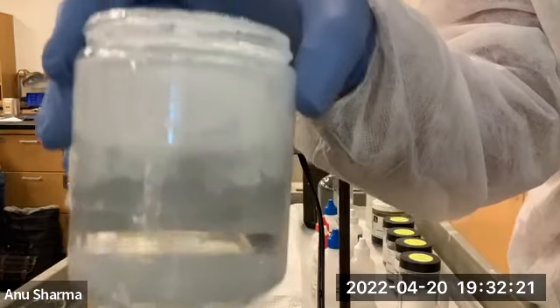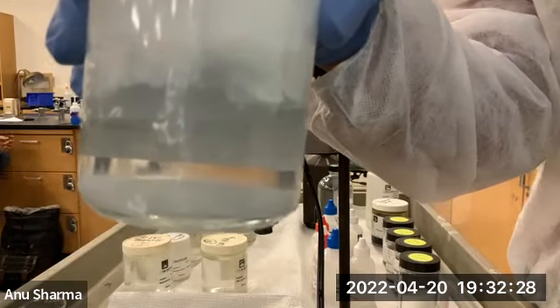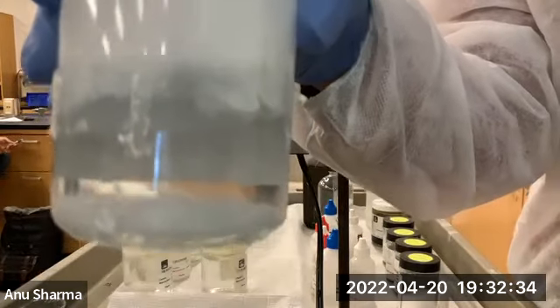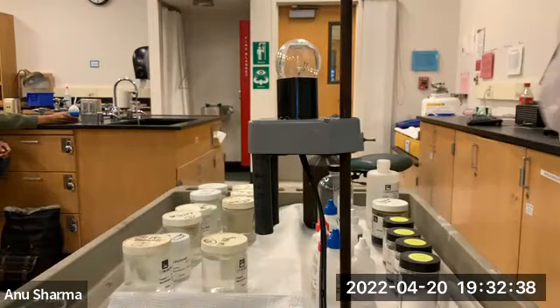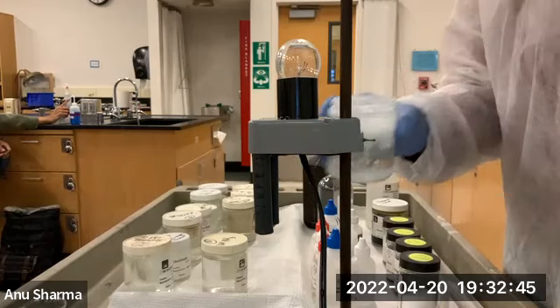That's the exception. All the hydroxides are insoluble except sodium hydroxide, like the group 1A and the ammonium. But barium hydroxide will dissolve in water, but partially. Some of it is soluble, but some of the white stuff you see is still insoluble, okay? But let's see, will it conduct electricity or not? In other words, is it going to ionize into barium ions and OH ions?